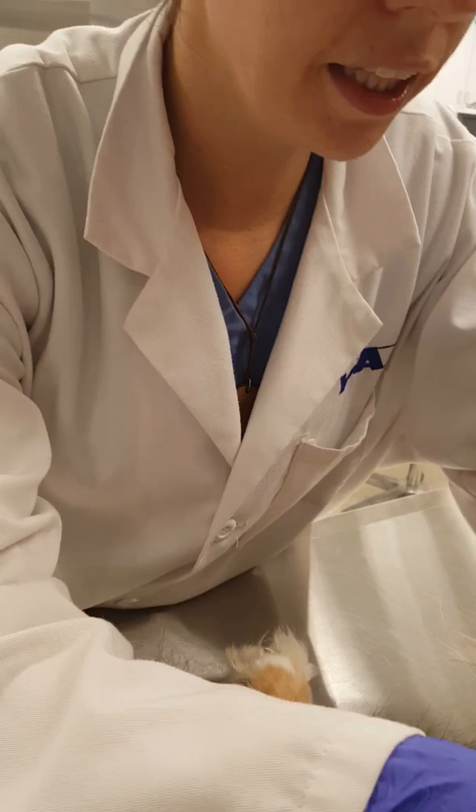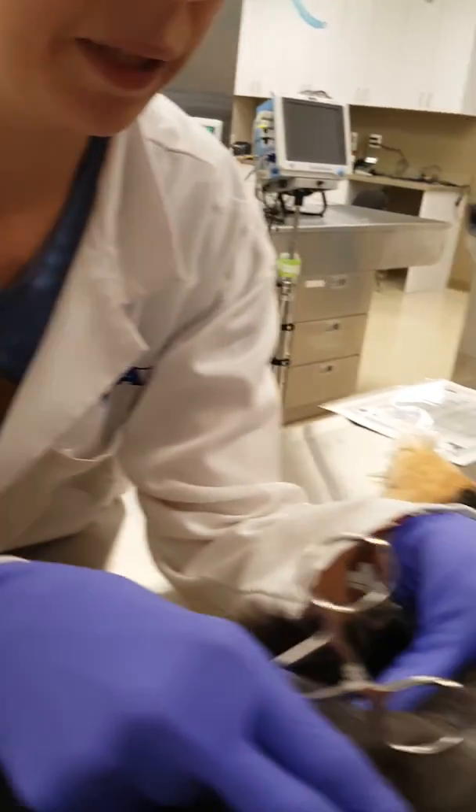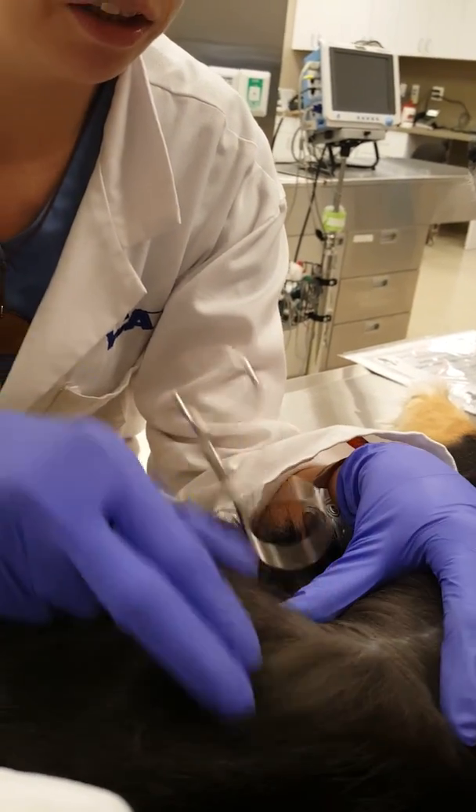So Faith has a little balding area here that we're just a little concerned might be a fungal infection or ringworm.